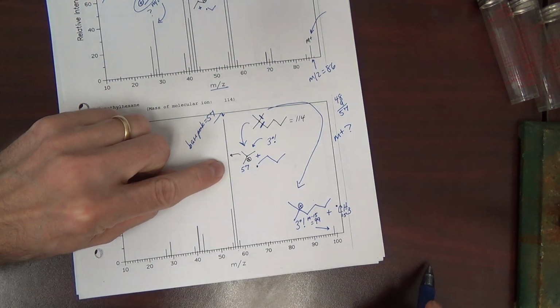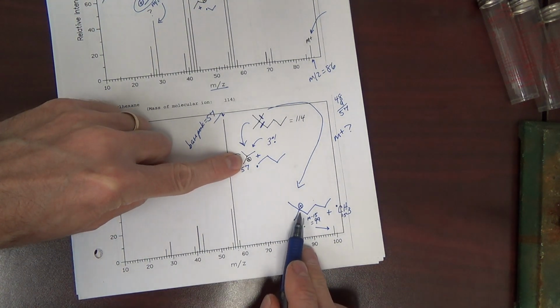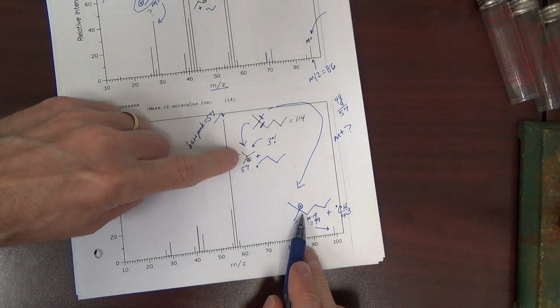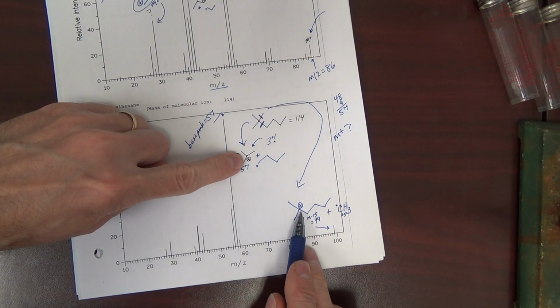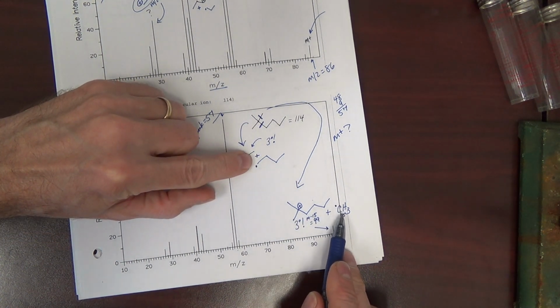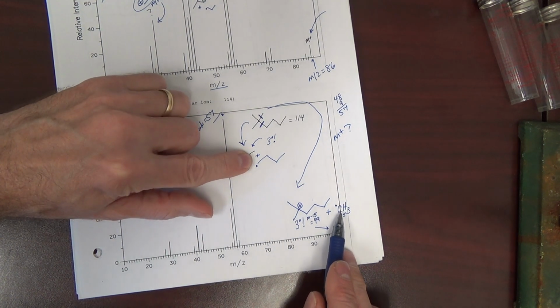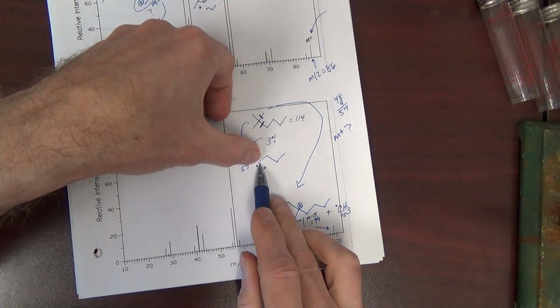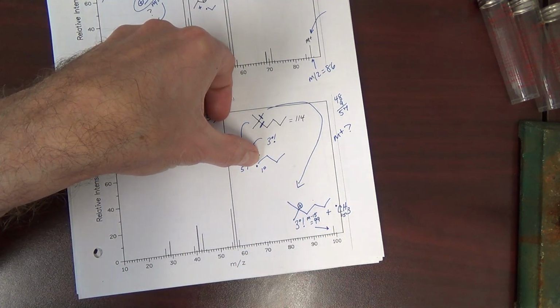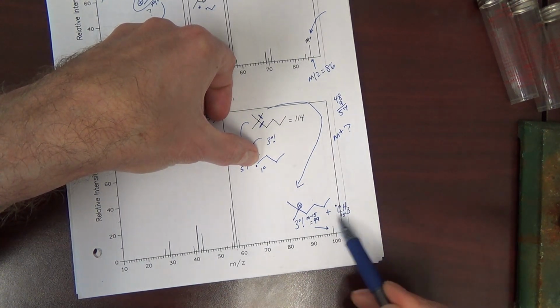Why would this be a better cleavage peak? That's a tertiary cation. I mean, they're both tertiary cations. Why would the molecule prefer to make this one? The answer here is not the tertiary cation. The answer is actually the radical. Its stability is still an important consideration. Which is more stable, a primary radical or a methyl radical? This carbon's connected to one other carbon, primary. This carbon's connected to no carbon, so it's not even primary. This would be considered methyl.